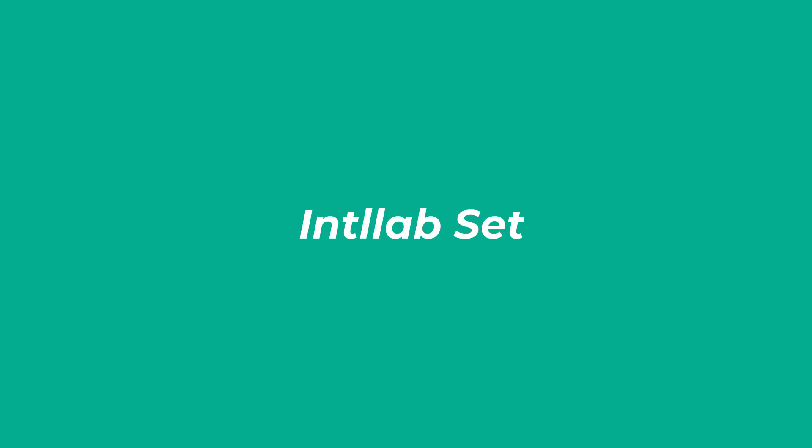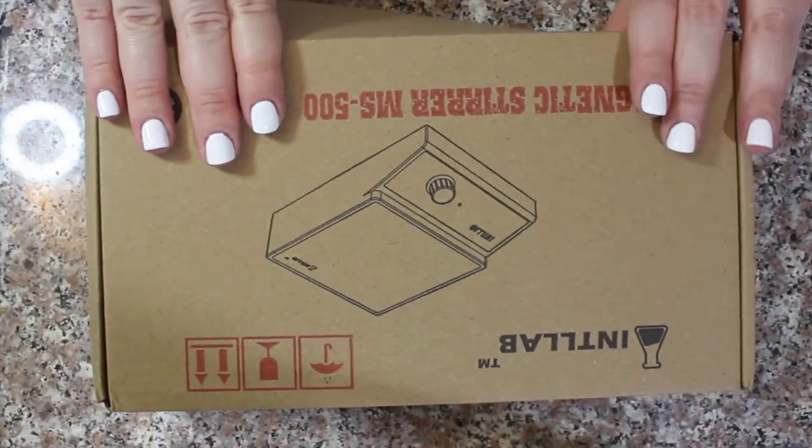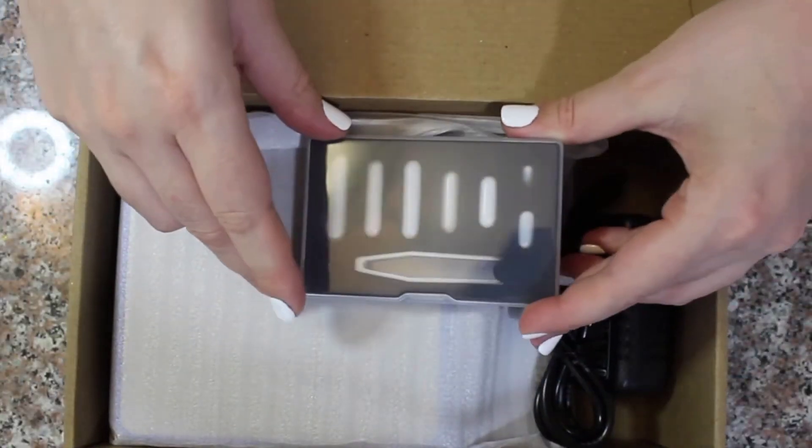Number 3: Intelab Set. The Intelab Set comes with 7 stirrers, 35mm in length. It also includes a small pair of tweezers to handle said hardware, and a 10-inch retriever to help you fish them out when you're done.